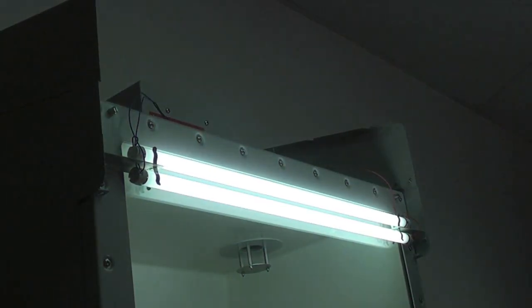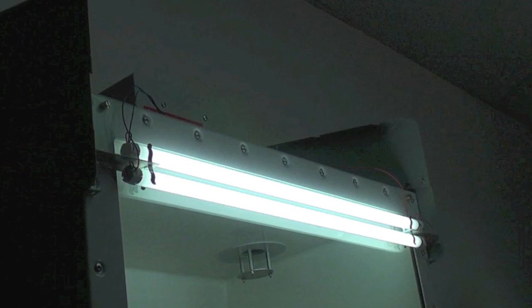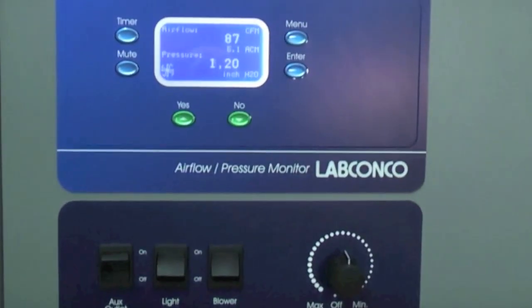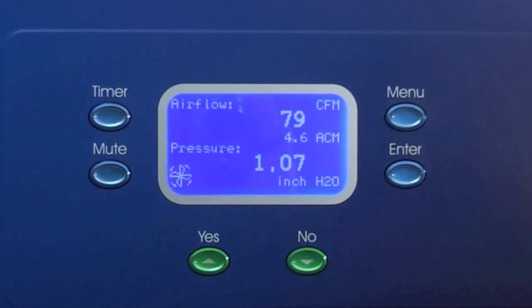Two exterior 25-watt fluorescent lights provide lighting that exceeds 100-foot candles. The LCD display provides real-time parameters.